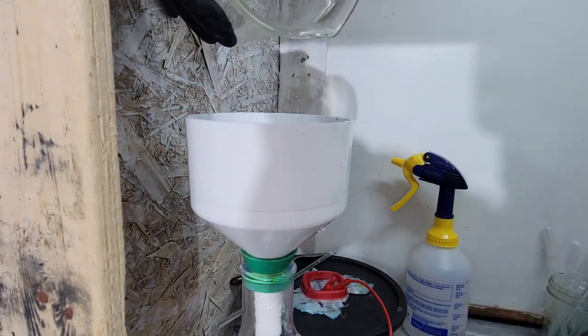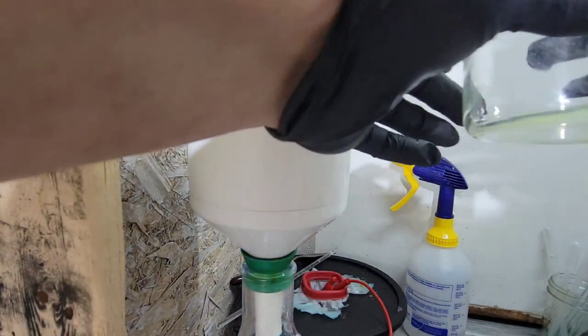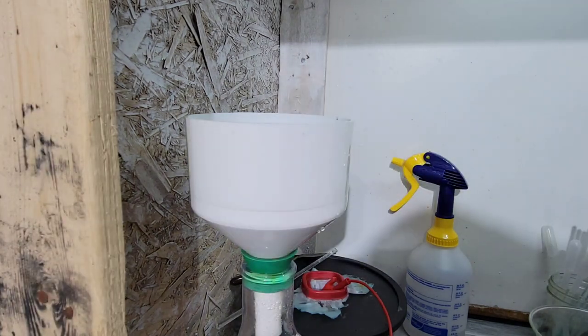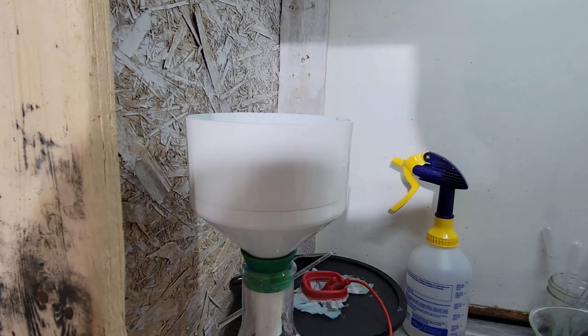I also ordered a couple smaller beakers too, for instead of dumping it in right from the nitric bottle, I'll be able to pour it into the smaller beaker.